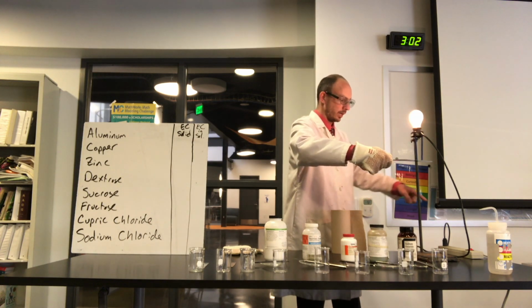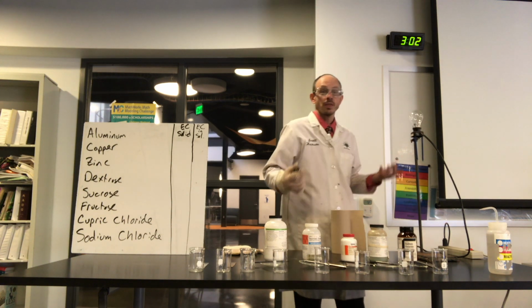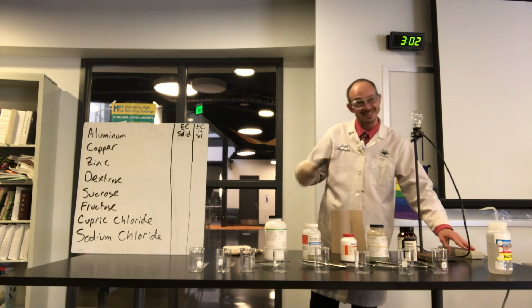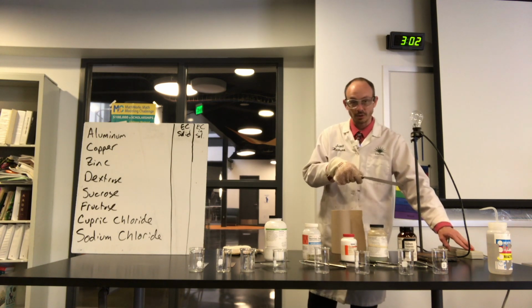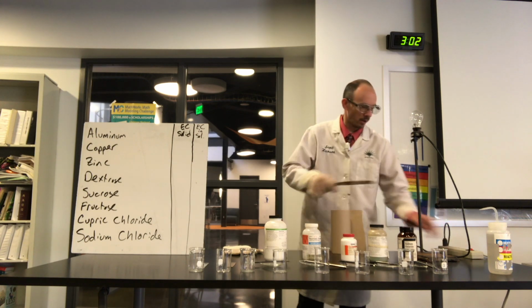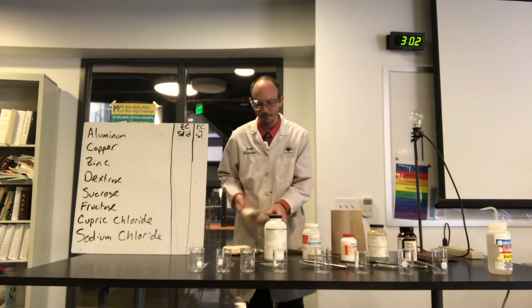the light goes on. So as long as this light is on, or this switch is on, then it's going to go. Now I am going to turn this switch off and on while we're going because I do need to clean these electrodes while we're rolling, okay? So right now I'm going to keep it on though because we're going to do our solids, all right?